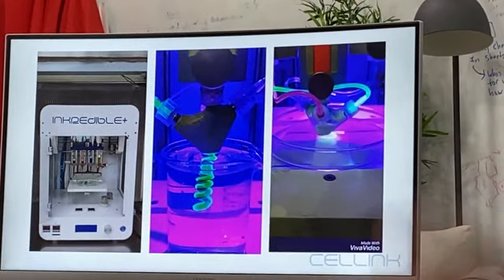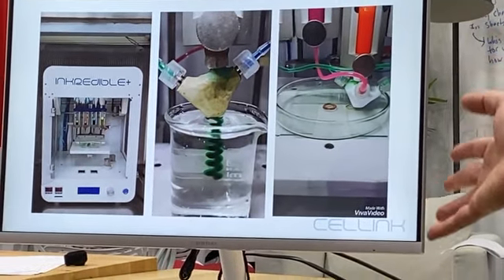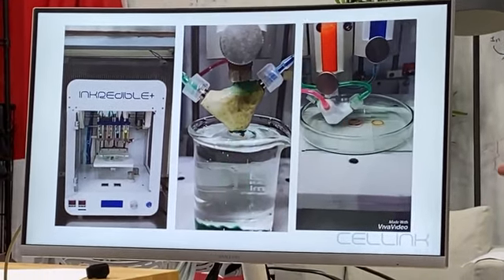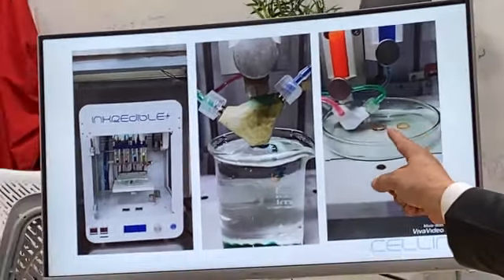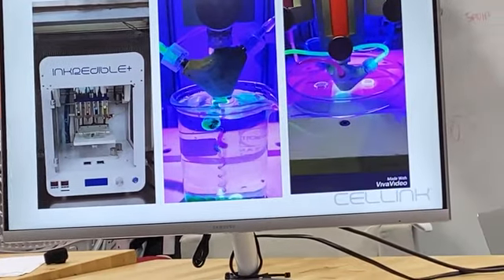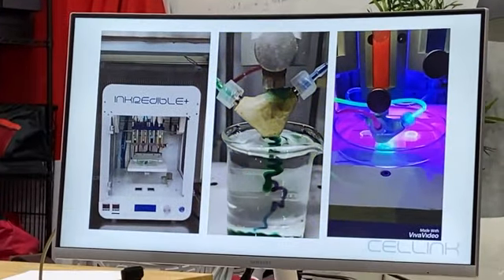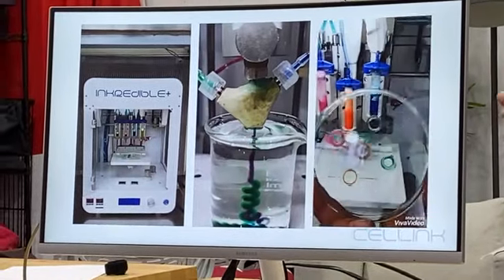Sorry if I interrupt you. I developed the coaxial nozzle just to print a structure like veins, like vascular networks. As you can see here in the video, you can print all materials at the same time in a concentric way, like I say, in a coaxial way, or each material in a single way. So this kind of nozzle can be used as well in normal printing, or to print food or something like that. The only application of that is not only bioprinting.